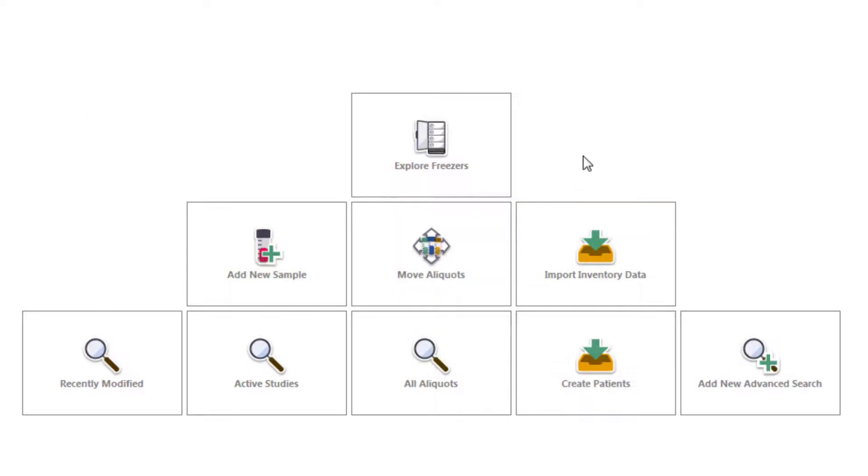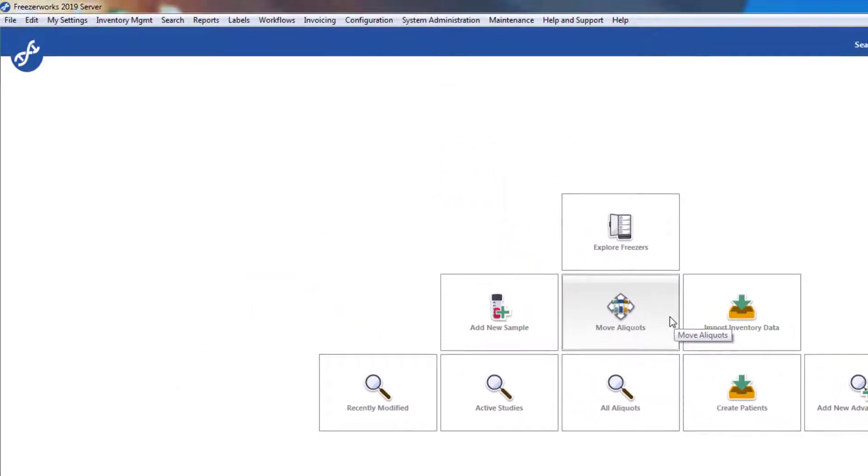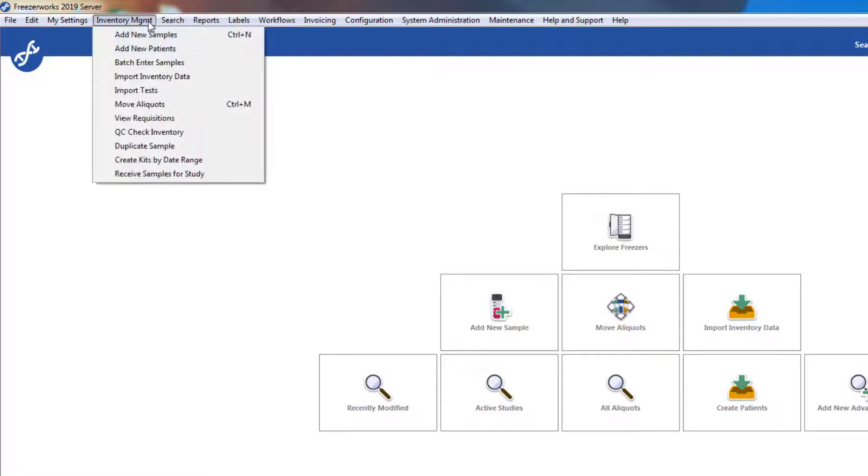To open Move Aliquots, either add it to your home page for easy access, or open the inventory management menu and select Move Aliquots.